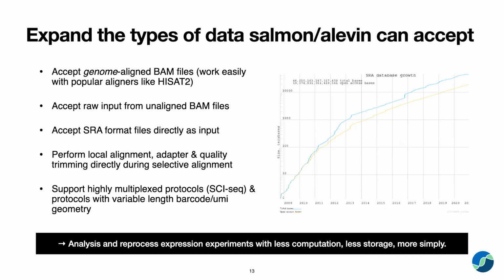Also, because Salmon is a randomized inference algorithm, it assumes that the reads are in random order, which would not be the case in a sorted BAM file. So there are some challenges in terms of how to implement them, and that's what makes this interesting. But the end goal is to enable the ability to reprocess and process larger and larger collections of experiments.